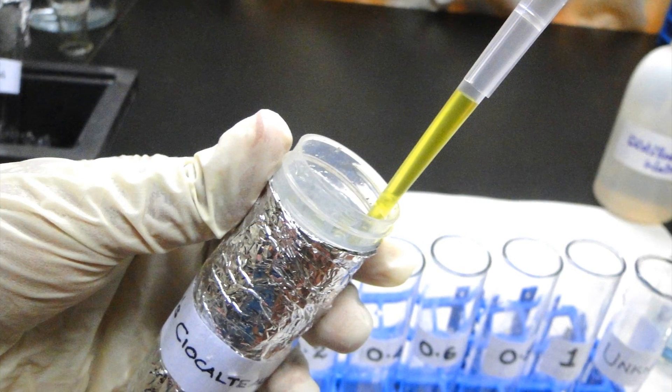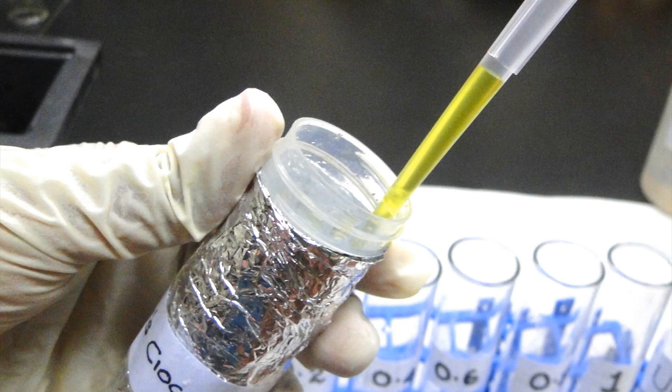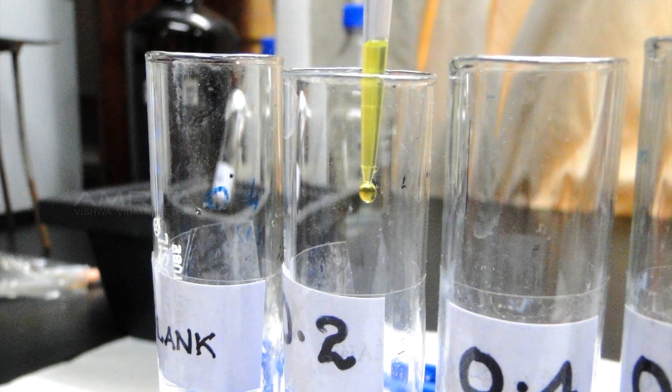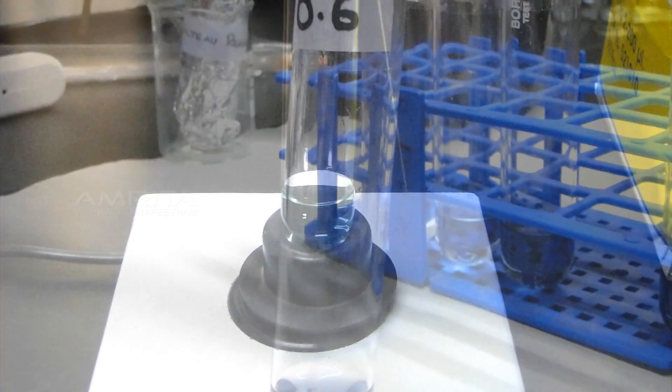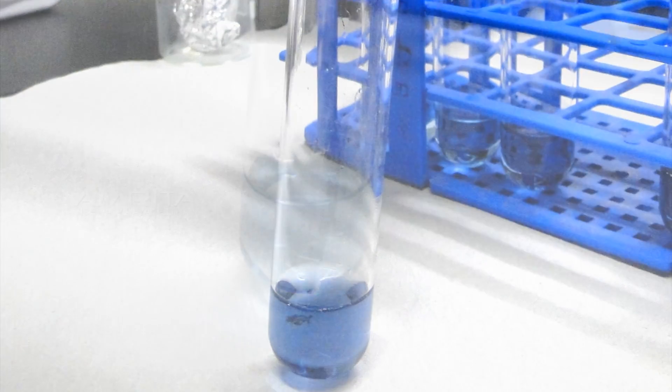After incubation, add 600 microlitre of Folin Ciocalteu reagent to all test tubes using a micropipette. Vortex and incubate for 20 minutes at room temperature. After incubation, the color intensity varies accordingly with the concentration of protein present in the tubes.